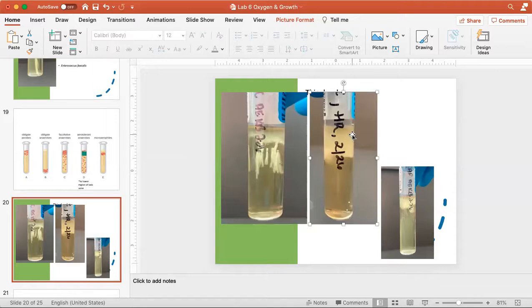This tube has heavy, heavy growth in the oxic zone. That's where it looks sort of cream colored. And then I think you can just see there's a string that's starting to grow right here. It's not a very big string though, is it? It's just faint, but there is a string growing down in the bottom. That's why I also like this tube, because this tube has much more evident strings coming down.